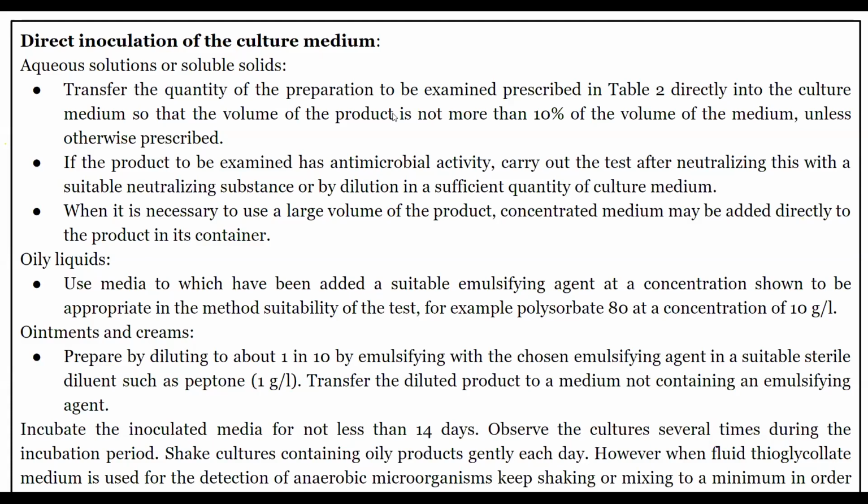But the formulation which is incorporated into fluid thioglycolate medium should not be disturbed or mixed. This is because mixing will reduce the anaerobic condition, so the growth of anaerobic microorganisms will be suppressed. So soybean casein digest medium should be gently mixed every day where it contains oily formulations or ointments and creams, but the fluid thioglycolate medium should not be disturbed, otherwise the anaerobic condition will be interrupted and this results in poor growth of anaerobic microorganisms.